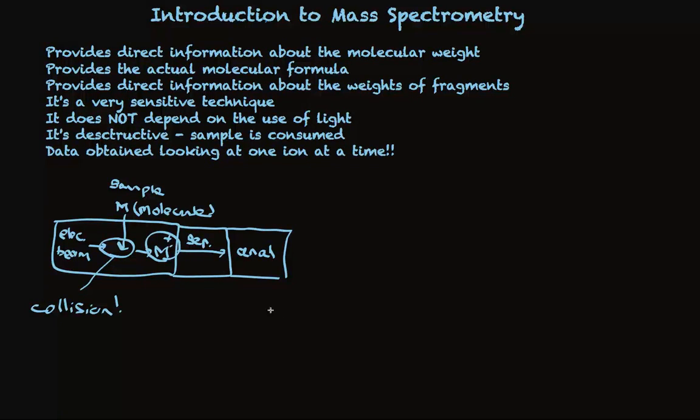And the analysis tells you the molecular weight, which actually is a reading of the mass to charge ratio.